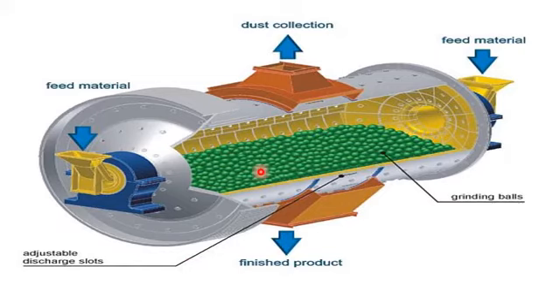Please note that this ball milling method is more commonly used in crushing and grinding of nanotubes, and commonly used balls are based on ceramics, flints, pebbles or stainless steel balls, so they are used as a crushing material to crush a bulk material. Okay.